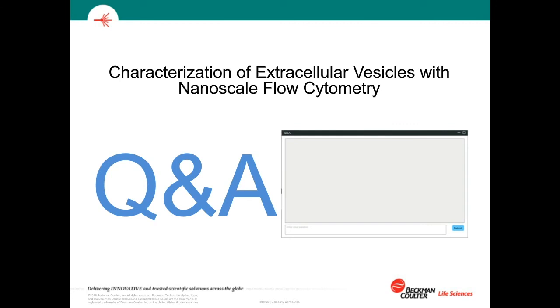Okay, another one, does the broad distribution of EV populations affect resolution from background? It can. EVs aren't a really narrow dispersed population like a man-made particle may be. As opposed to having a really thin, narrow defined peak, they spread out a little broader. So if you're comparing signal versus noise of population versus, for instance, optical noise, it can make the population appear more like a shoulder sticking out from background if they're really, really small. But the identification of these particles can definitely be improved with immunophenotyping. In fact, it's necessary to immunophenotype to identify populations.